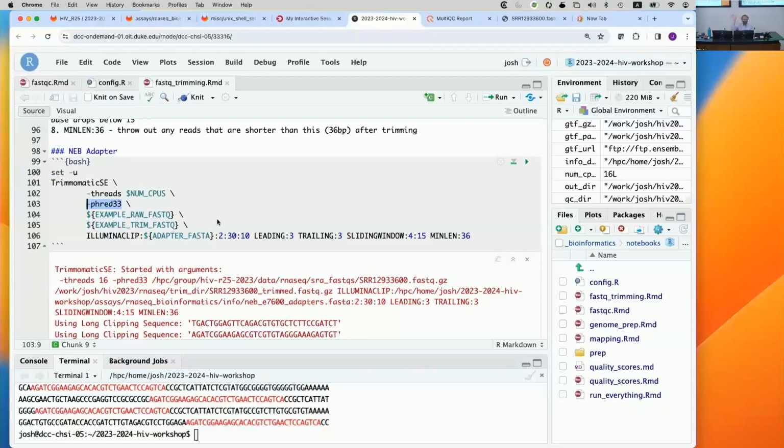And so they had the 64 version. There's no perfect way from the data to tell; there's no indication in the FASTQ file whether it's the 33 version or the 64 version. Unfortunately, there are Illumina... I shouldn't just blame Illumina because there are actually other companies that do this too, but Illumina is the most famous one. So there are Illumina FASTQ files floating around that have the 64 encoding.